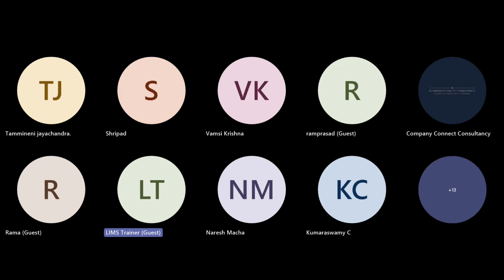Why are those blue? Because there is one table known as table master, and in table master, you made that field mandatory. I can make other fields blue as well. The point is, when I see this is blue, it means mandatory. I need to type here and save, otherwise it won't save. When I teach you, I'll tell you why this is blue and how to make it blue.